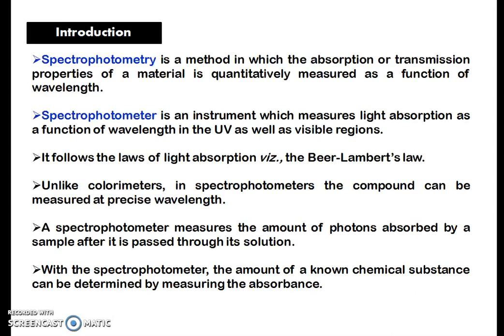Coming to the introduction, spectrophotometry is a method or a technique in which absorption or transmission properties of a material are quantitatively measured as a function of wavelength, while a spectrophotometer is the instrument or the equipment which we use to do this technique of spectrophotometry.